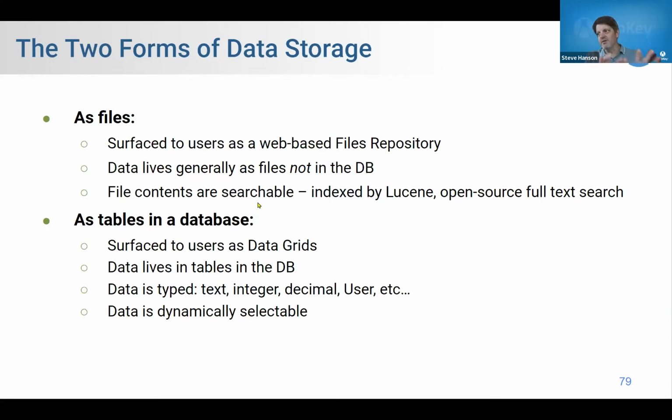The database tables are surfaced to users as data grids in the web UI. That data actually lives in the DB, and it obeys all the DB rules. Like the columns have data types like integer and decimal, and best of all, the data in a database is dynamically selectable, aka you can write SQL queries against it. And we'll look at that this unit.